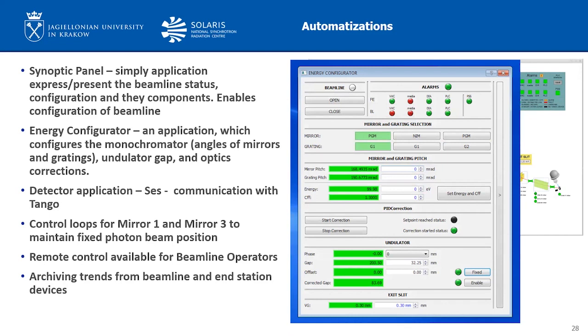It is enough for the user to add the measurements, and also the detector application, which, as the name says, can communicate with Tango and the energy configurator. Consequently, you can program the sequence, press start and do the measurements, as you have a well-prepared sample and programmed sequence in this program.